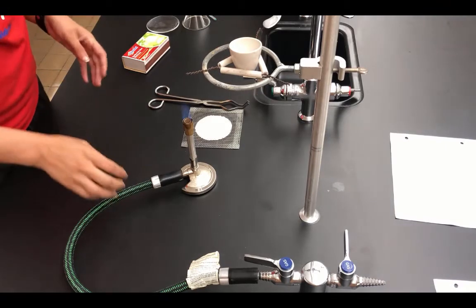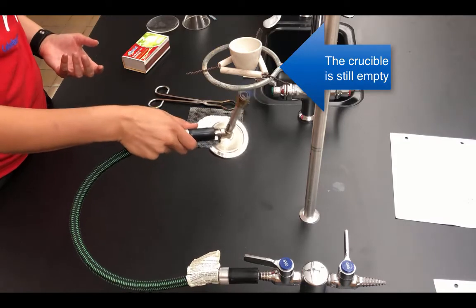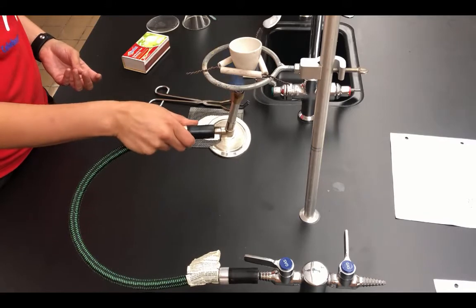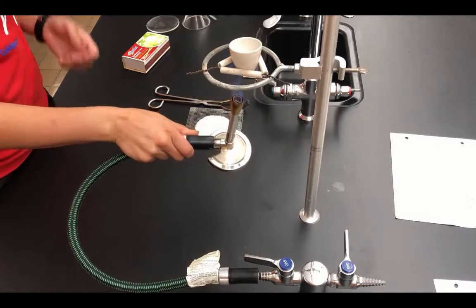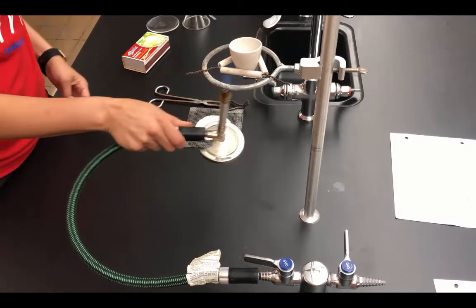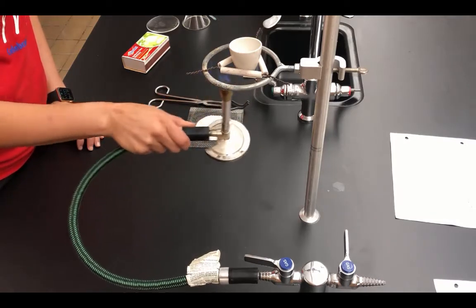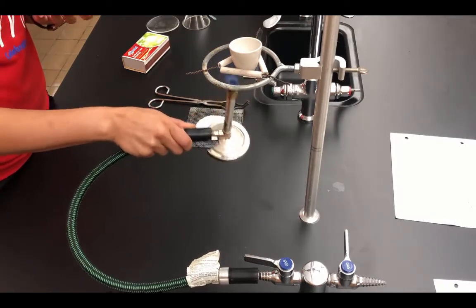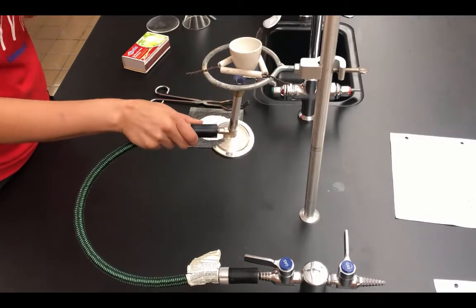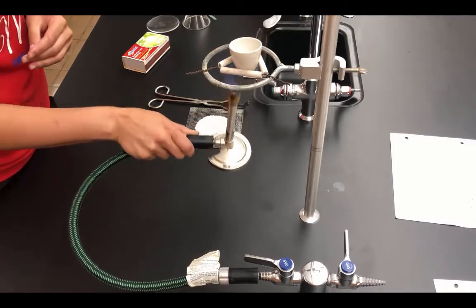I have it lit. Then we're going to brush the bottom of the crucible with the flame for 1 minute. When you brush it, you want to just wave the flame back and forth. You do not want to let it sit because then it's going to heat the same spot on the bottom of the crucible and it will crack the crucible. So for 1 minute, we will go ahead and brush the flame. What we're doing is making sure that we heat any water that might be inside the crucible. We want to make sure that that is gone. We don't want any water to affect our results.